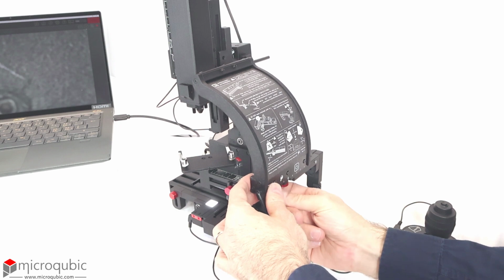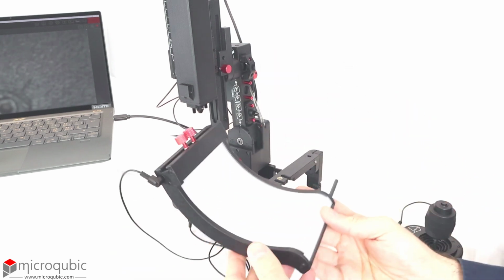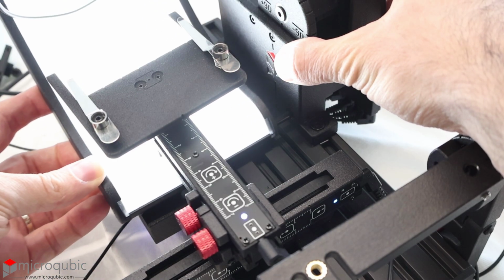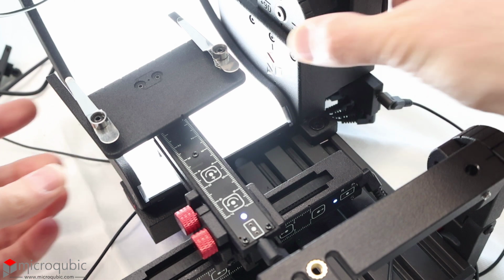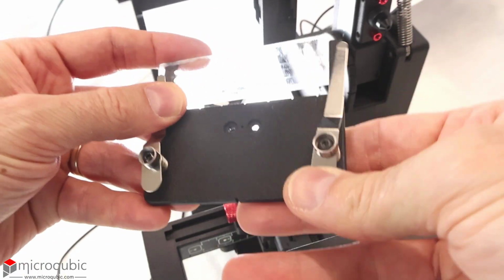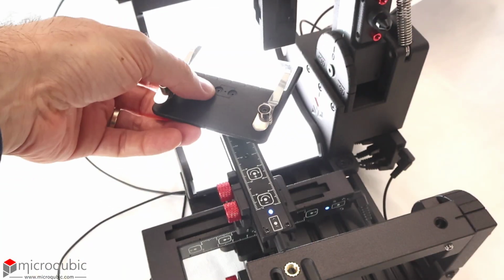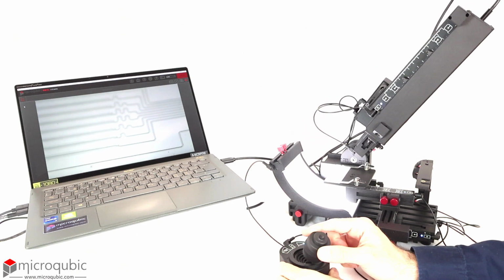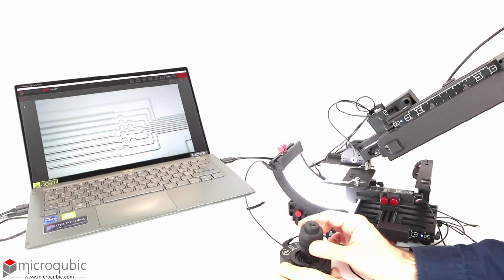Let's now move to the transmitted light microscopy mode, which can be used to image transparent samples like microfluidic chips. In this mode, the curved illumination is placed underneath the sample, as shown in the video. Then you can use one of the provided sample chucks to fix your sample. Smaller samples can be placed on a glass slide or fixed using custom-designed holders.